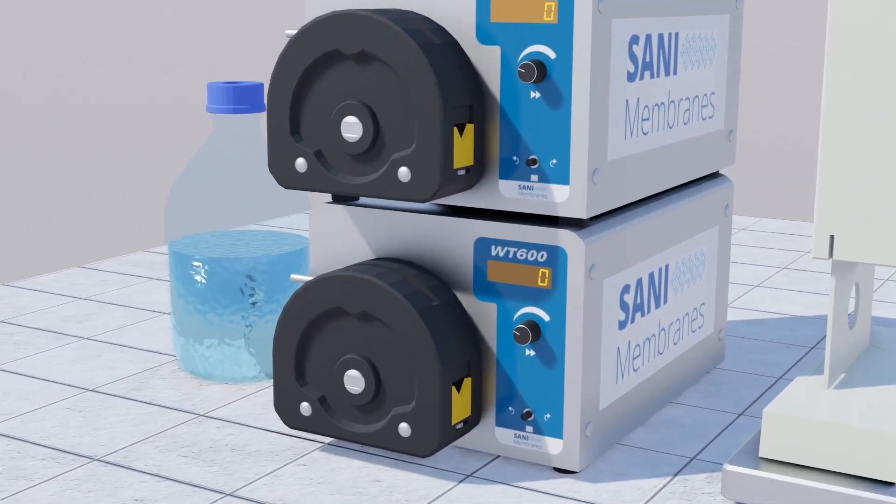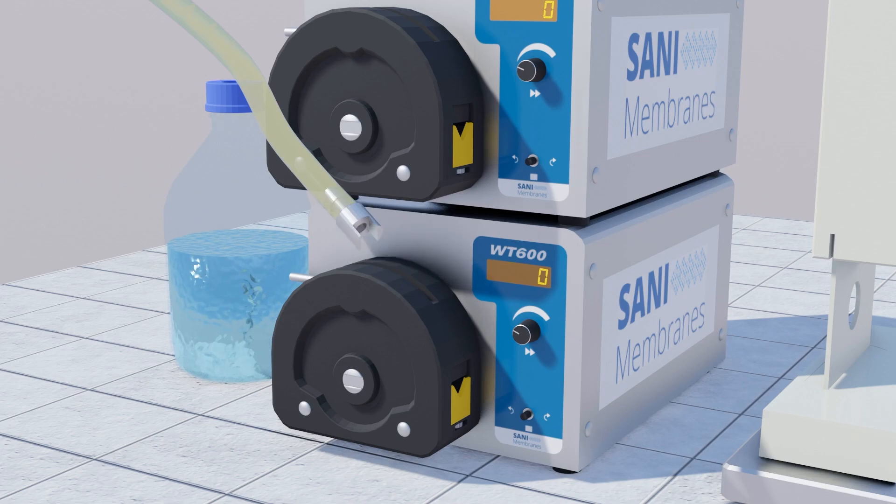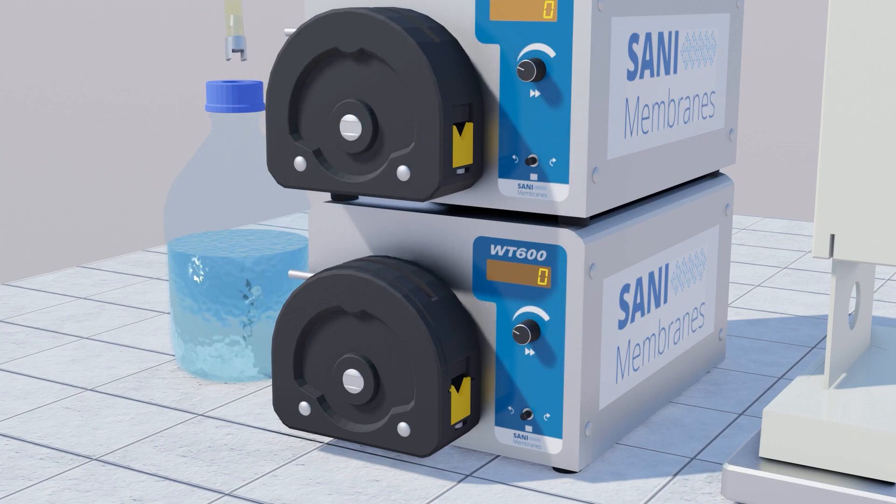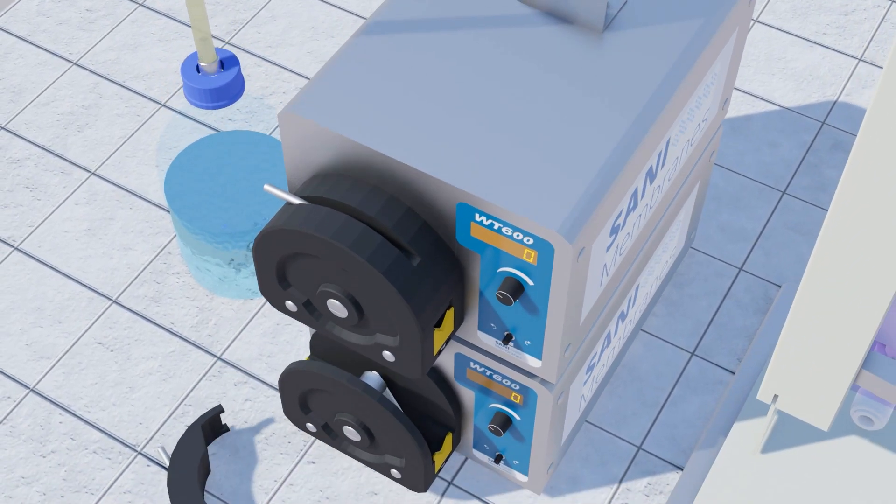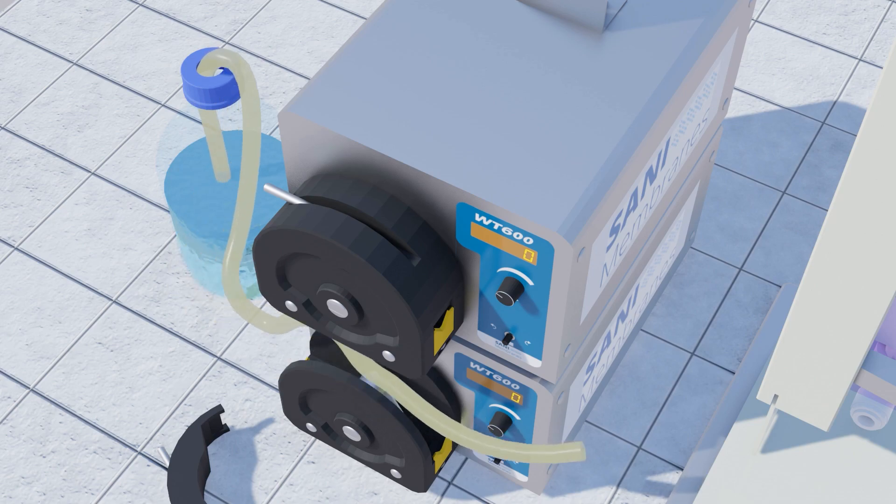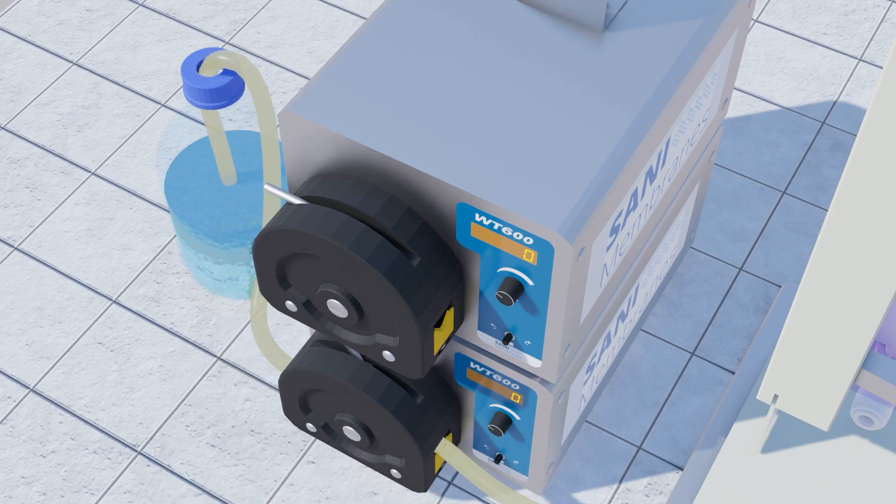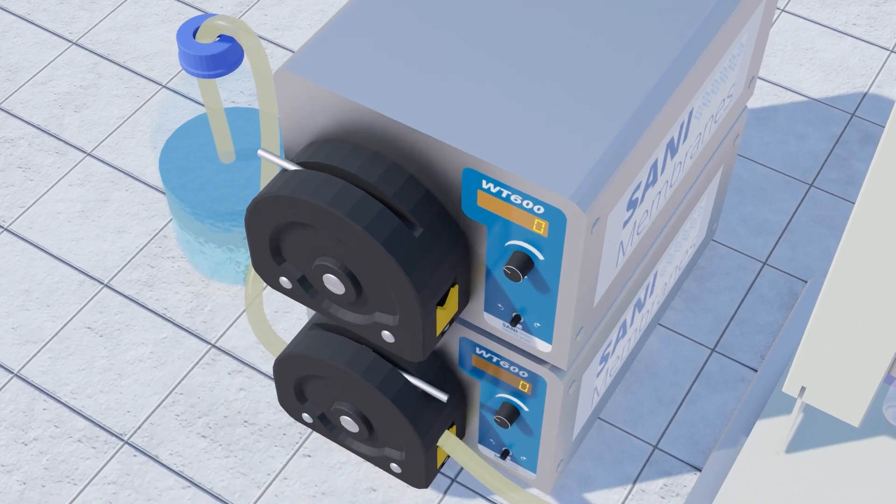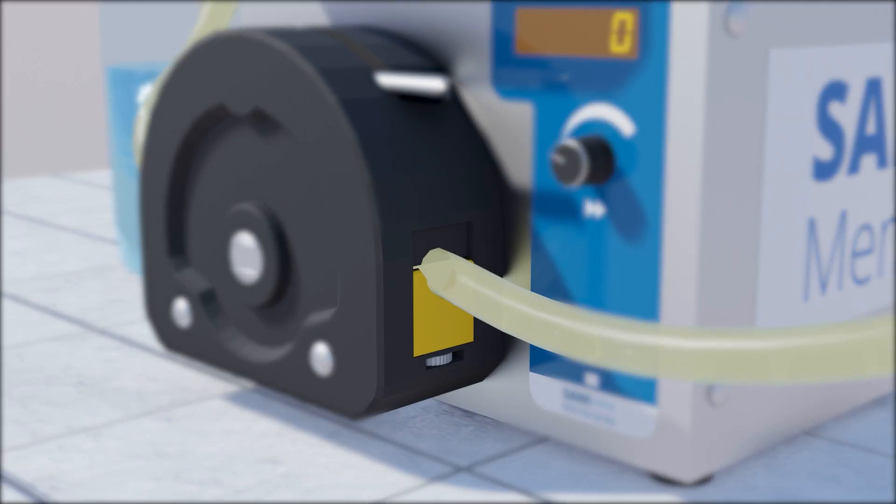Start with inserting the tube sinker into the pump tubing and place the tubing in the feed vial and going through the pump head. Turn the lever to lock in the tubing. Tighten the screws on both sides of the pump head to secure the tube in place.